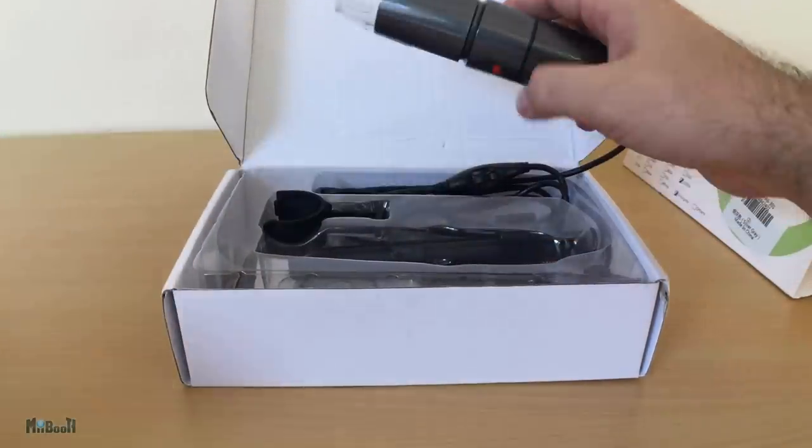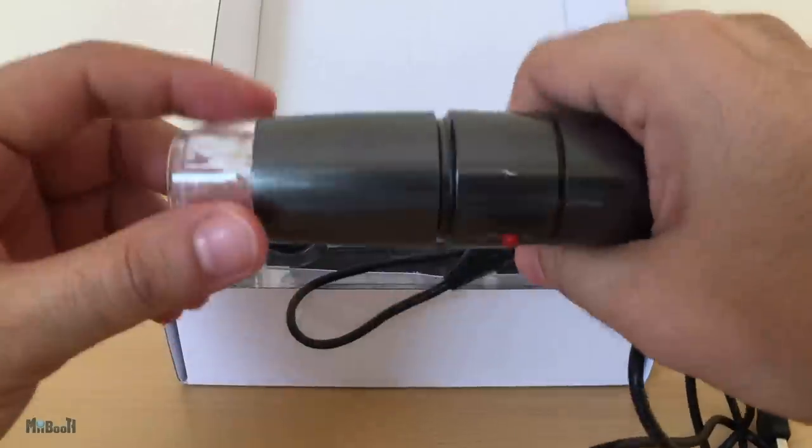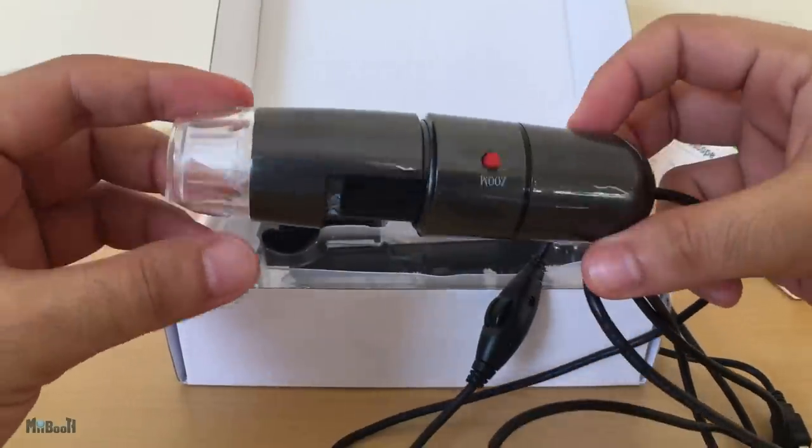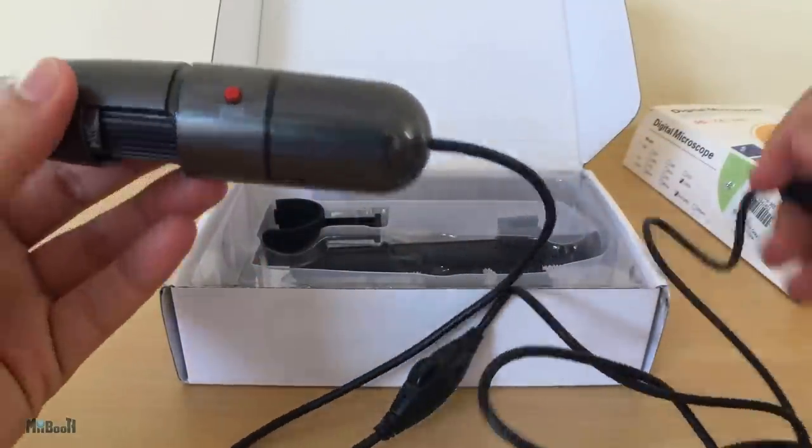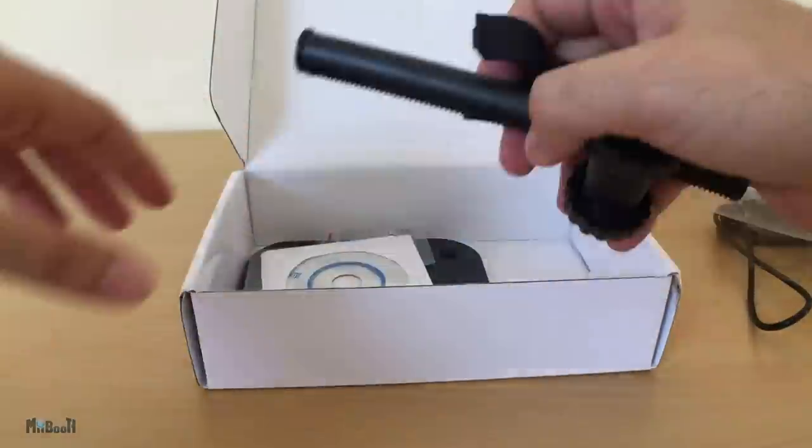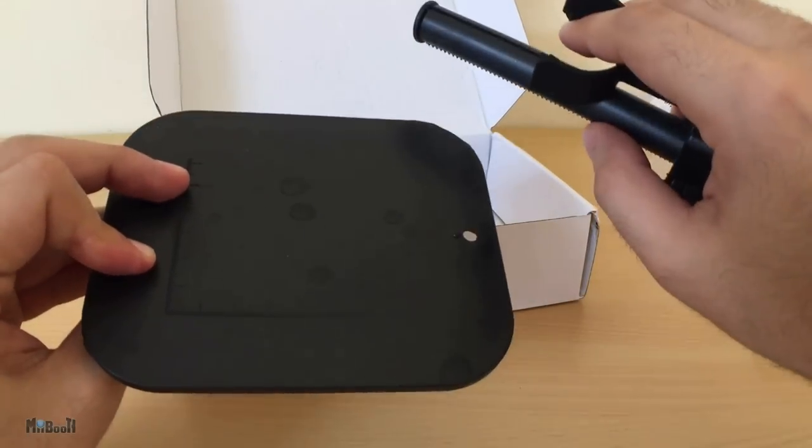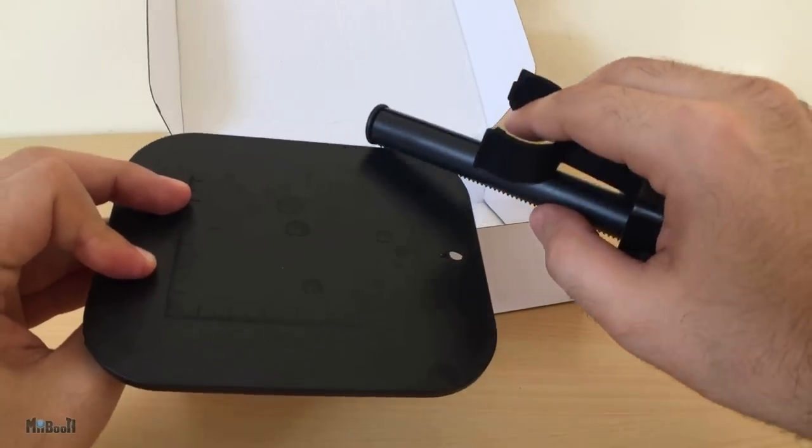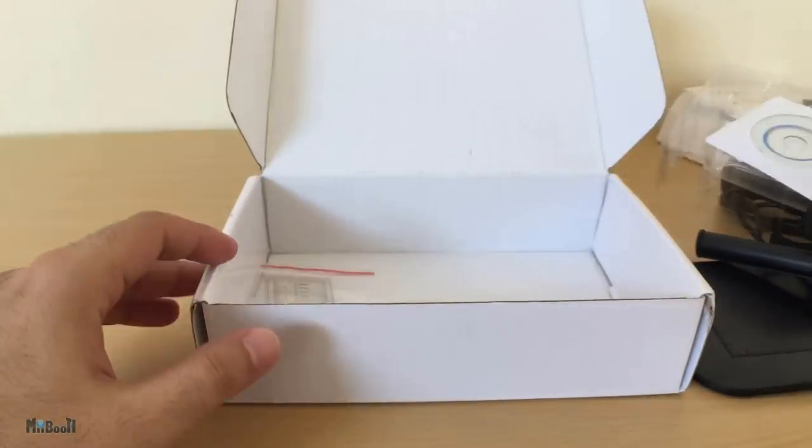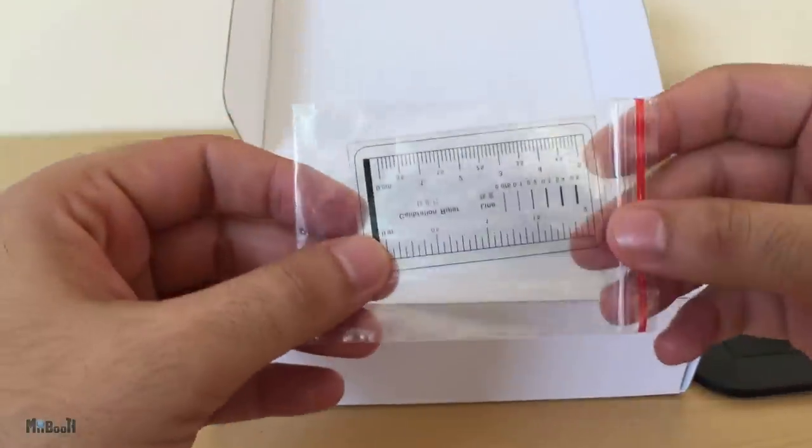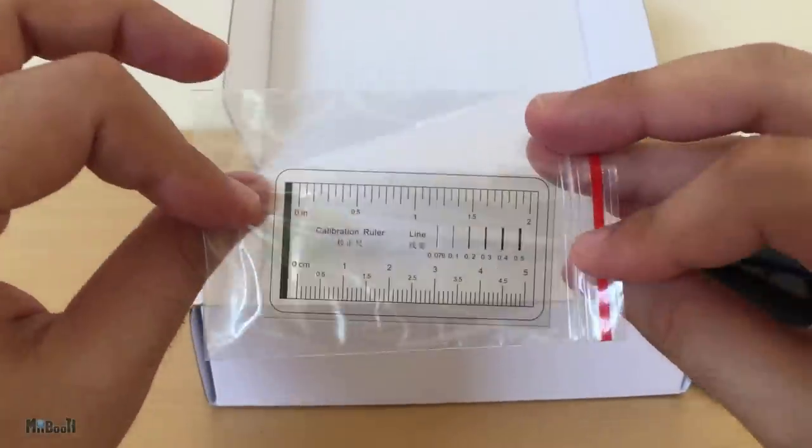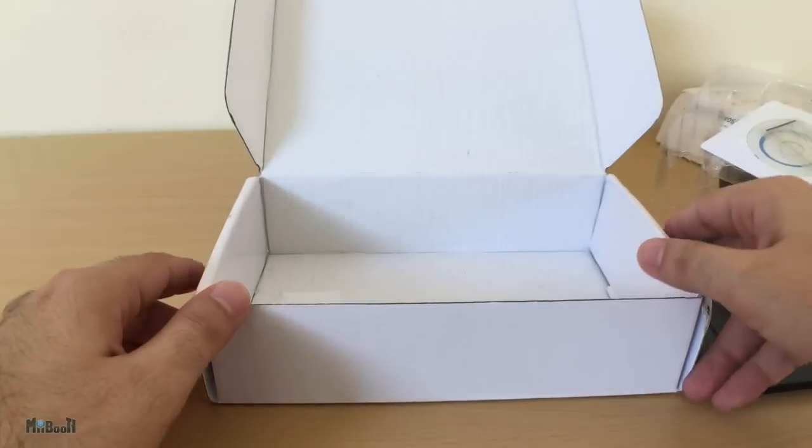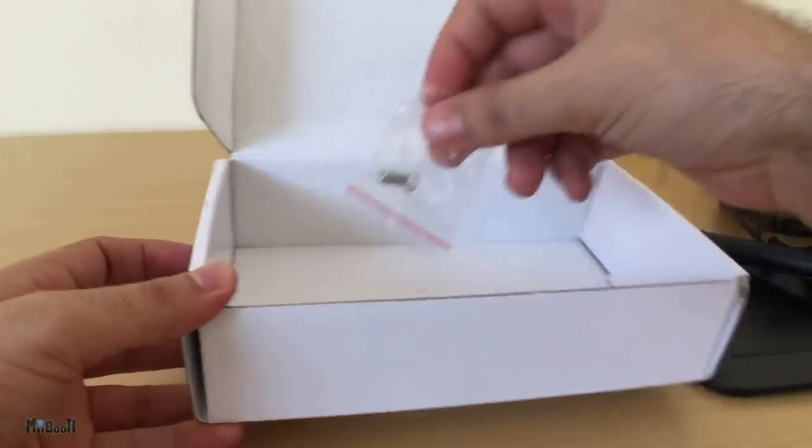First, we have the microscope. As I said earlier, it looks like a stage mic. There's a USB cable attached to it which goes into the computer. Other than that, there is a simple stand with a base plate which we'll put together in a moment, a CD with the drivers and relevant software, and finally a calibration ruler. This is the most interesting part. You can calibrate the microscope and then effectively measure the dimensions of your object.